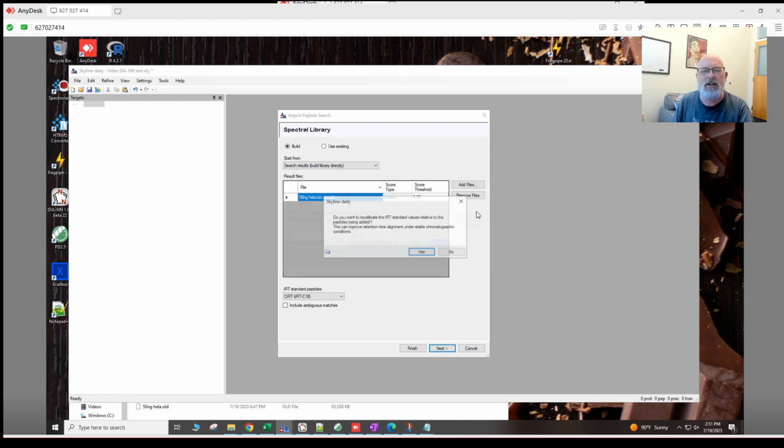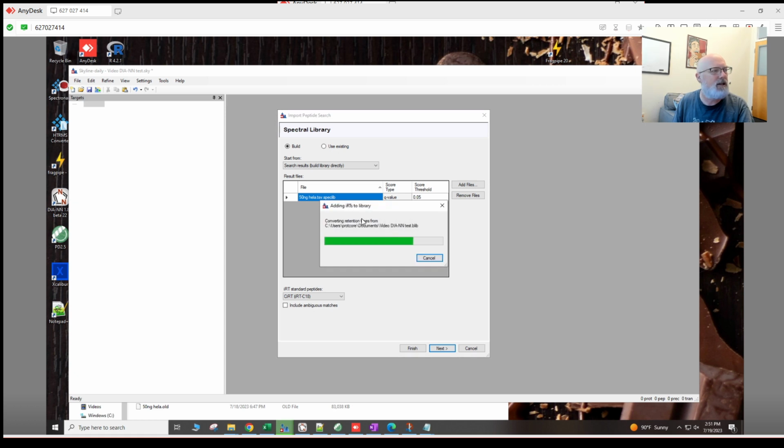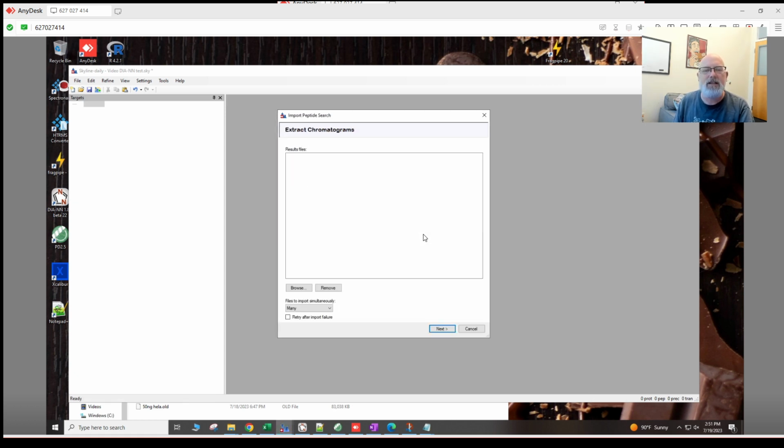And remember, I'm going kind of fast, so you guys can rewind the video and slow down. Okay, so I hit OK. Do you want to recalibrate the iRT values relative to the peptides being added? Sure. Yes. Why would we not want to do that? I don't know. Okay. All right, updating peptides.